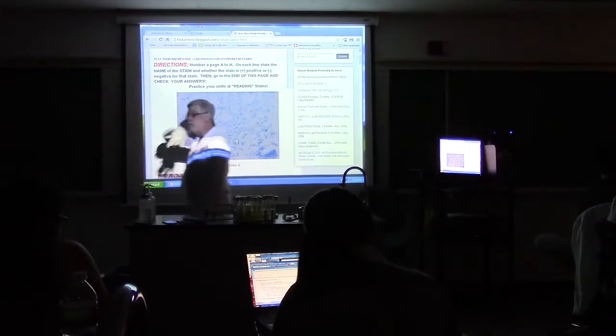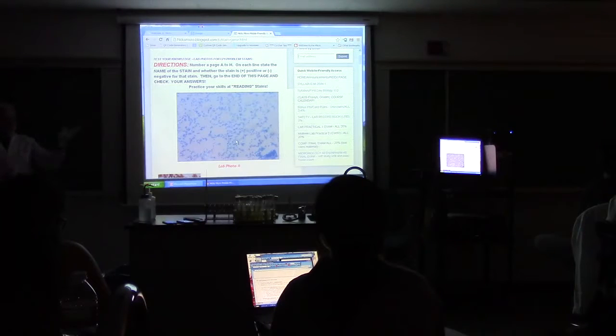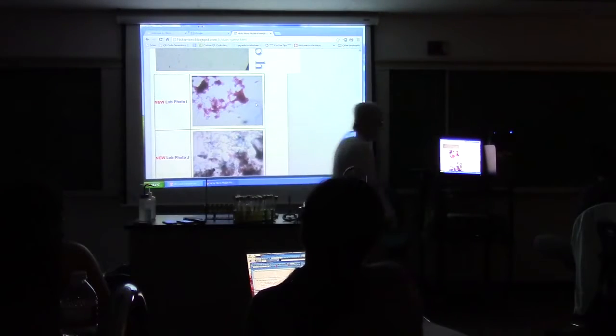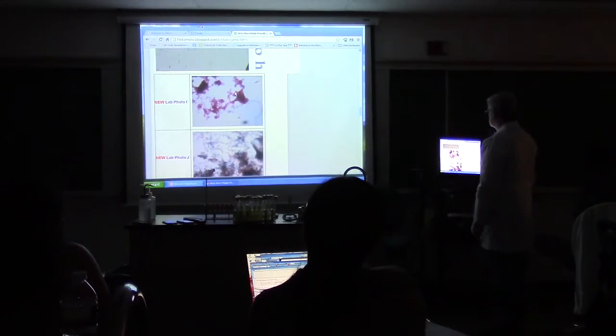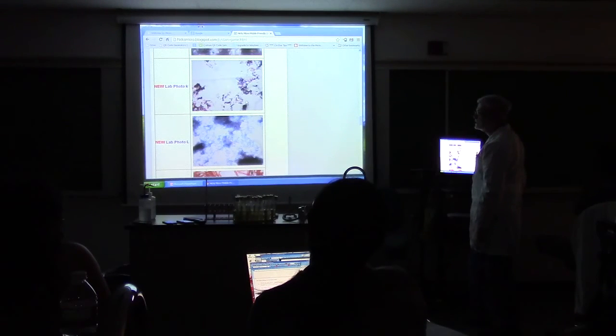Now remember, how would you know the stains? On a gram stain, your 2 colors are purple and pink. On an acid-fast stain, they're baby blue and fuchsia or hot pink. And on endospore, it's pink and green. So it is going to be a little bit hard for you to see, but if you do the pairings, you shouldn't have trouble. And remember, look at this one. This is safranin, pink, and purple. So what is it? Gram. And it's actually Mycobacterium on a gram, mostly positive with a few pink.